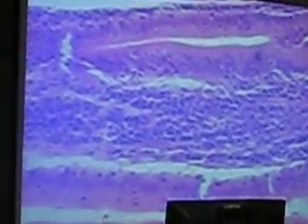Now, periodically, as you scroll through these villi, you might be able to see in some of these a lacteal. I won't ask you to identify the lacteal on the slide, but if you look at a villus and you see the lamina propria, there's a little pink strip running through the lamina propria. That's what a lacteal would look like. But like I said, I won't. They're spread out, and there's a few slides that have them, a good one, and most of them don't. So I won't worry about that on your slides. But for starters, you want to make sure that you can identify the villi and the tissues.